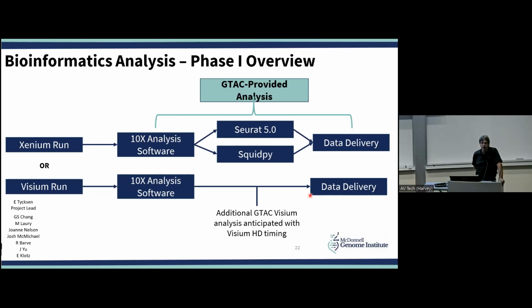So we're in the process of setting up some fairly robust pipelines to get people going. There is software that comes with the platforms. And for some of the things that they do, some of the images that you can do, the cell segmentation is getting much better with some of the 10x software, but it is pretty limited. There's just not a lot of stuff that you can do with it yet. Now that may change over time, but we're not going to wait. We're going to go ahead and get some of these workflows up and running in order to deliver a much more usable product to you for your research.